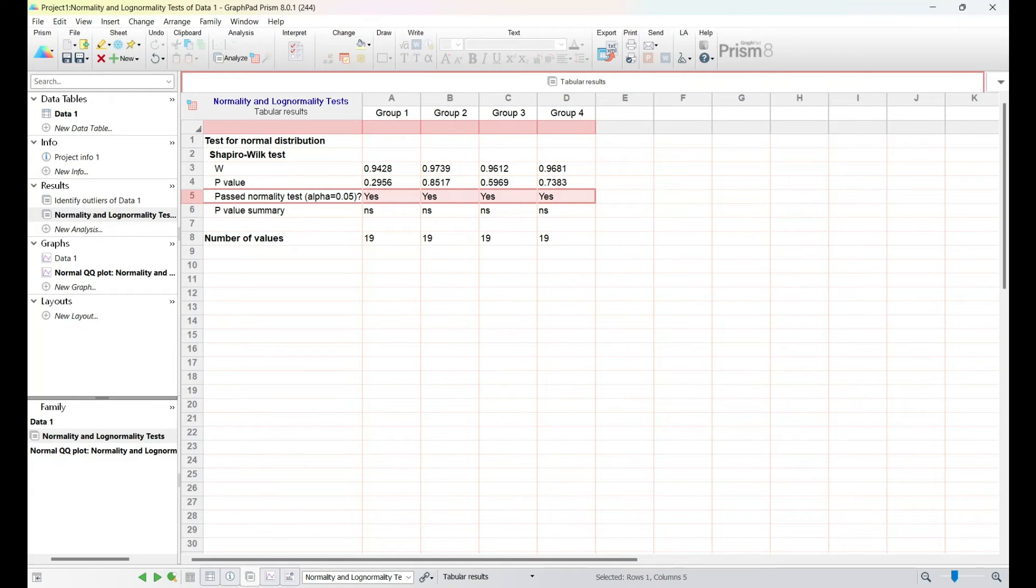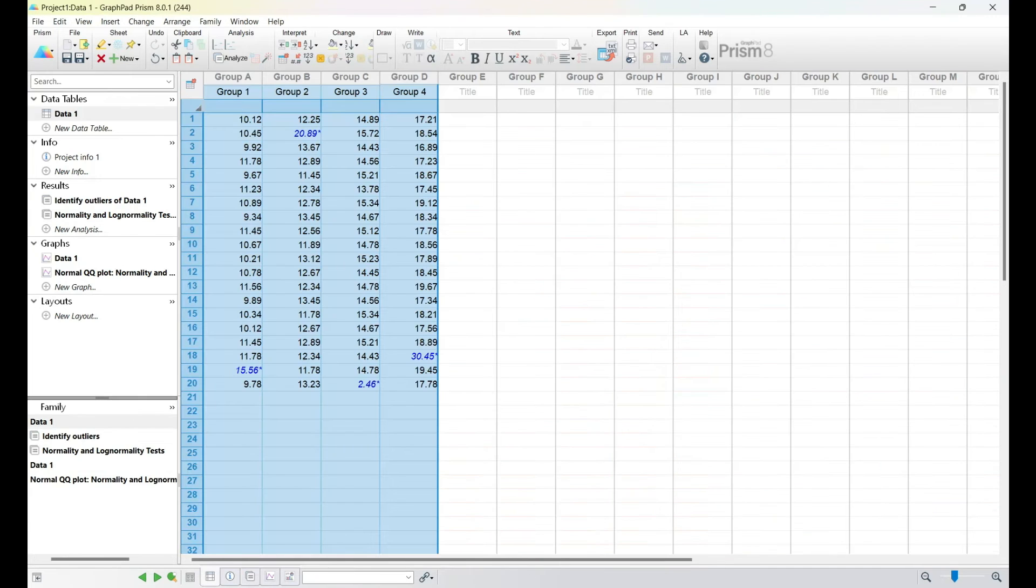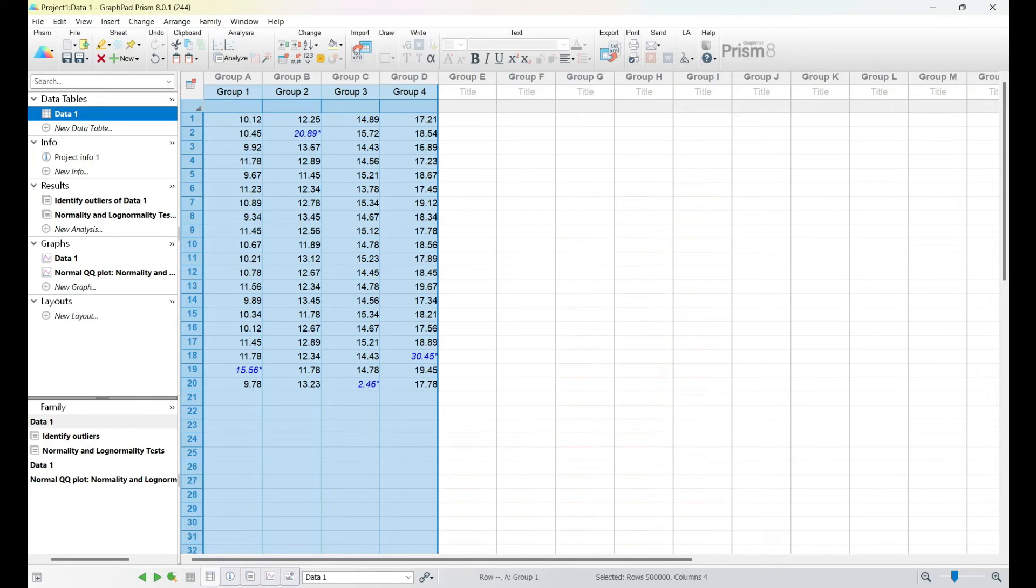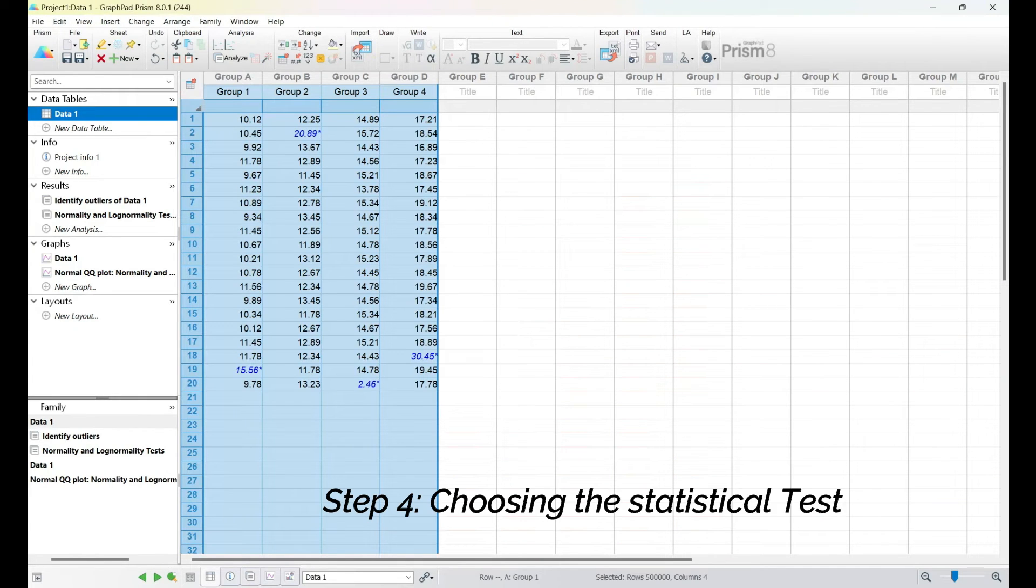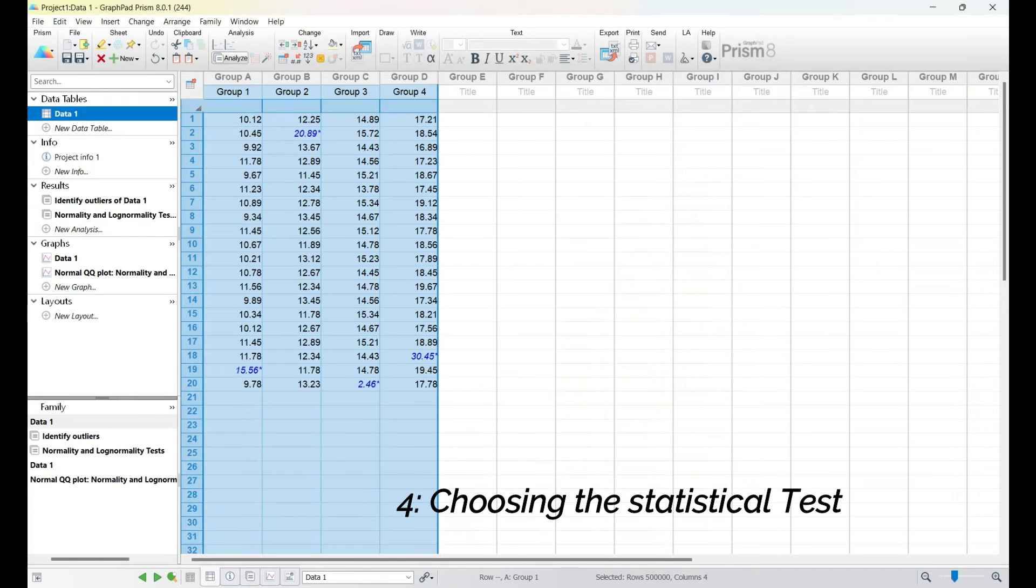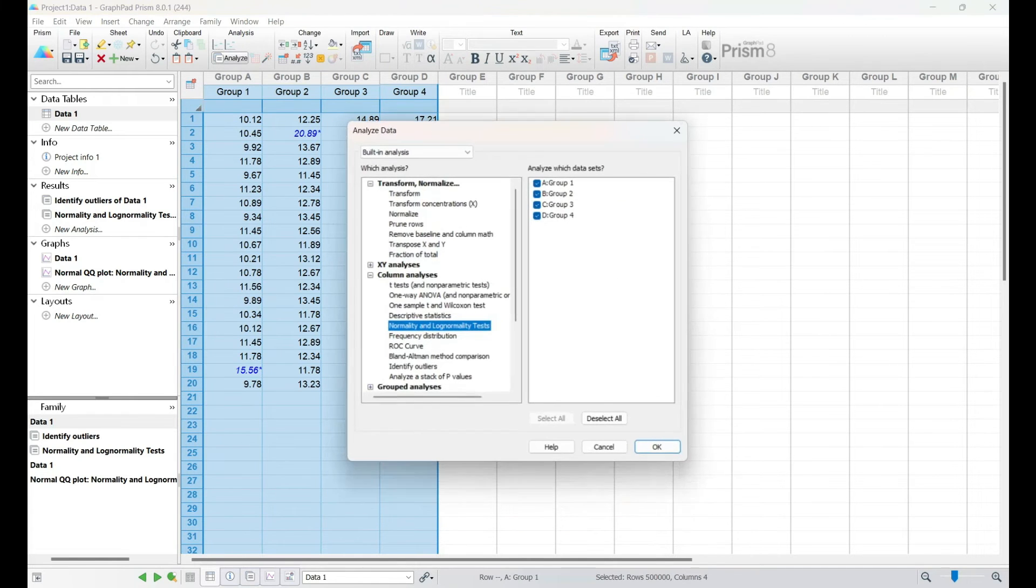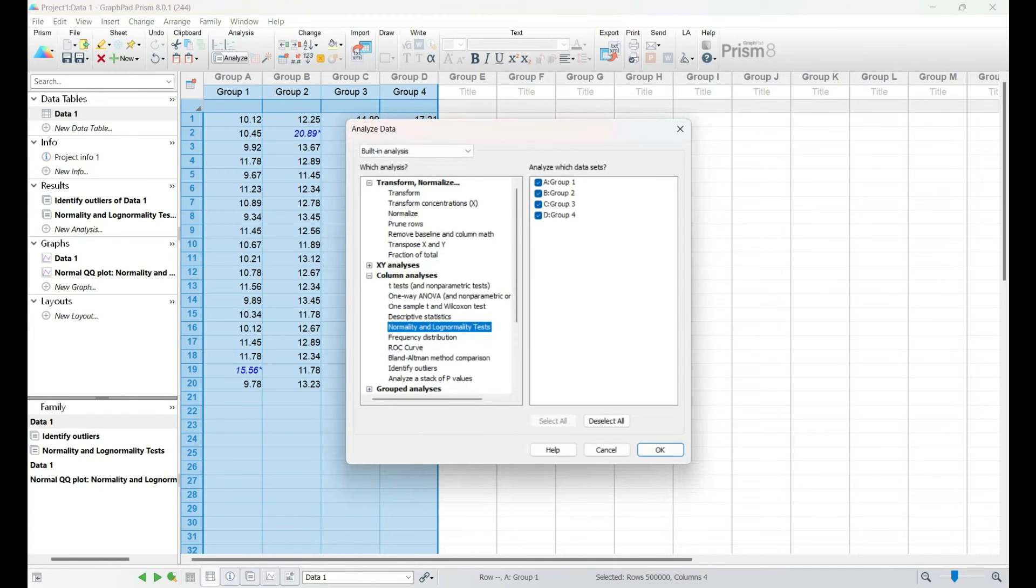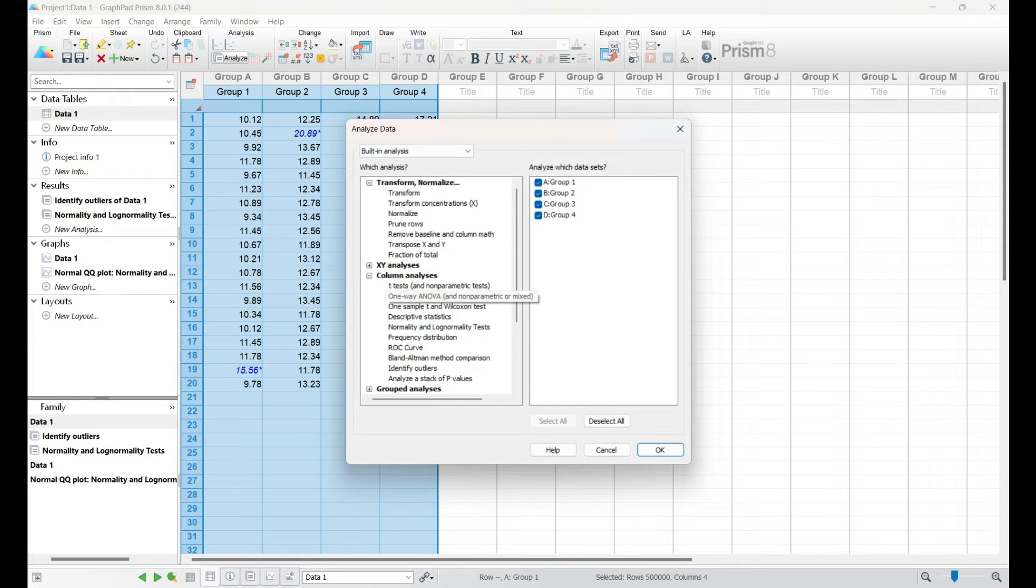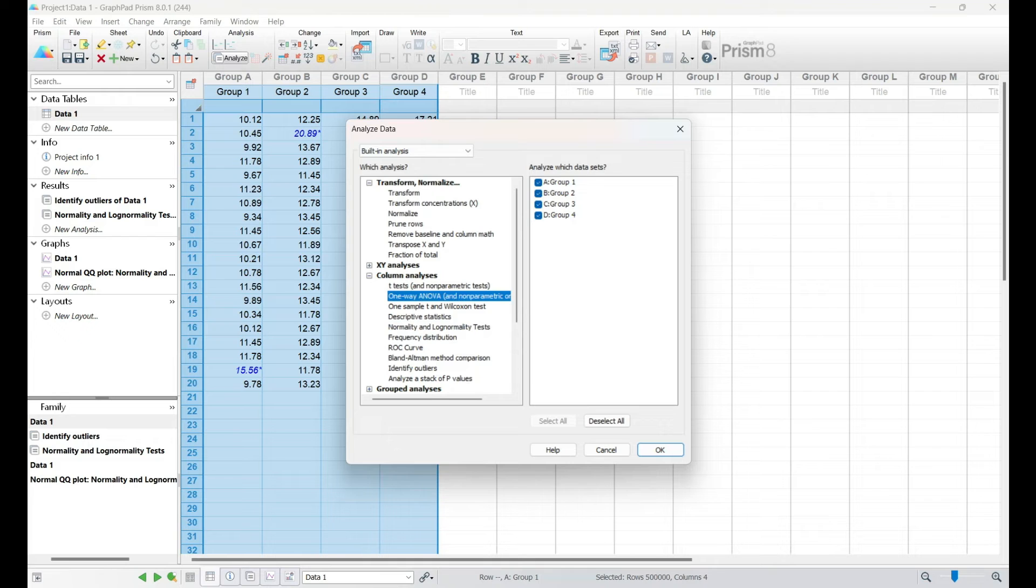With outliers addressed and normality confirmed, it's time to choose the right statistical test for our analysis. GraphPad Prism streamlines this process in the Statistical Analyses section. If we have two groups, we'll opt for the T-test. For more than two groups, the ANOVA test is the way to go.